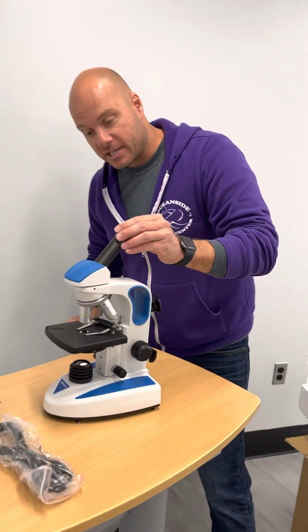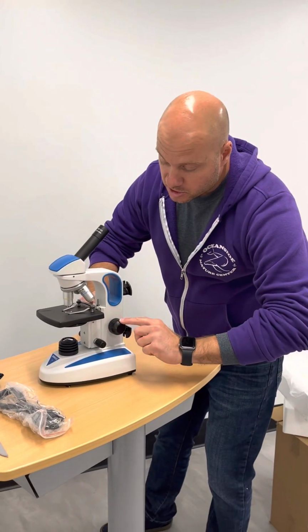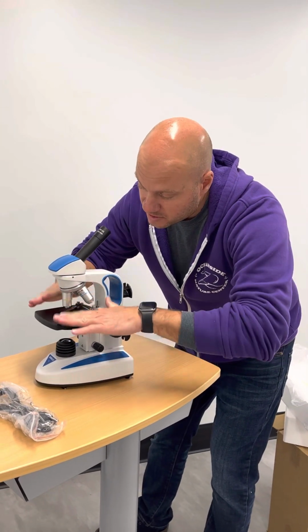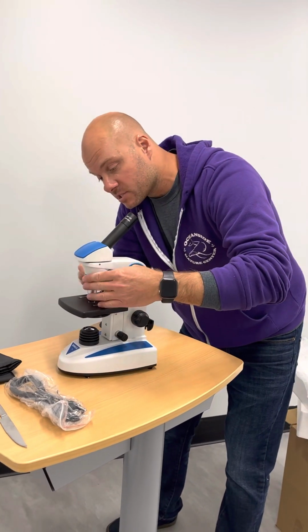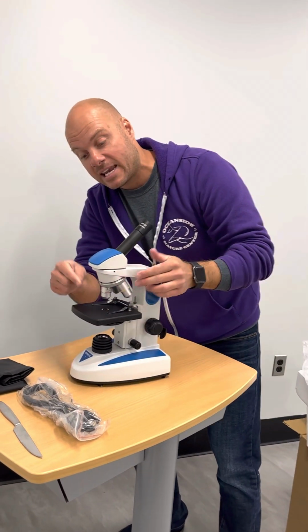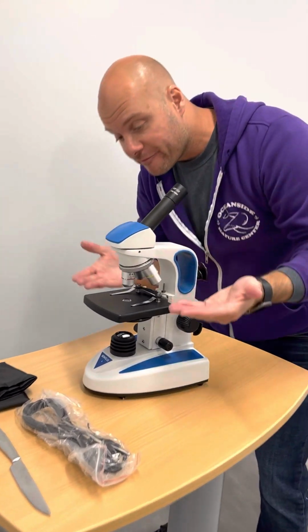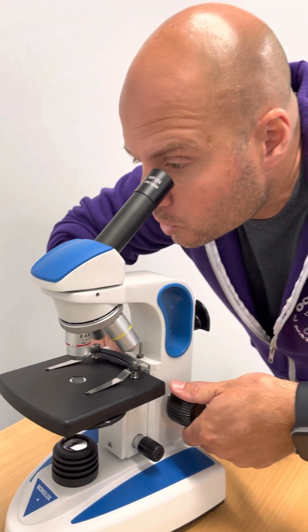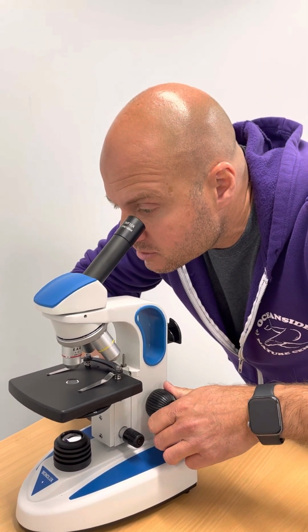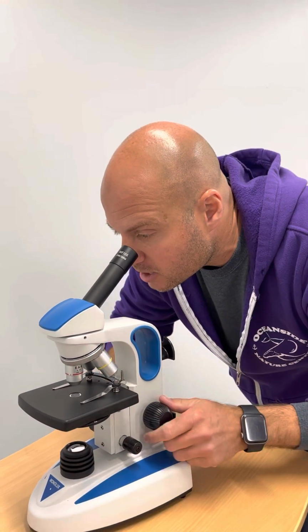So how do we use this thing? Well, first, we take our coarse adjustment knob, turn it away from us so that the stage goes all the way down. And then we put our microscope slide underneath. Make sure you start with scanning. Scanning is the one used to scan or find your object. And while I'm looking through the ocular lens, I'm going to turn until it comes into focus. So that's raising the stage until it comes into focus.